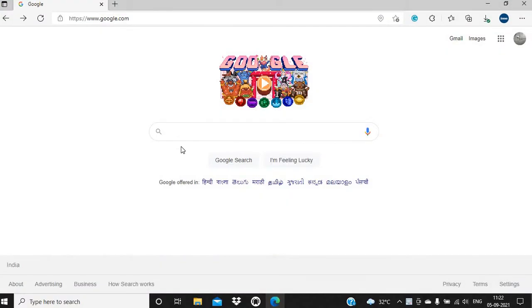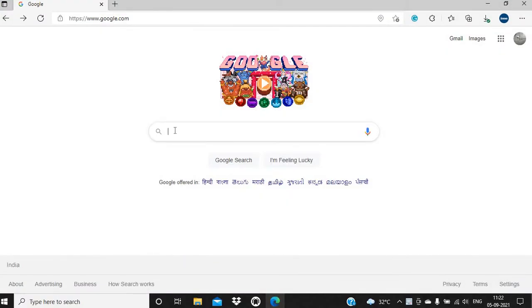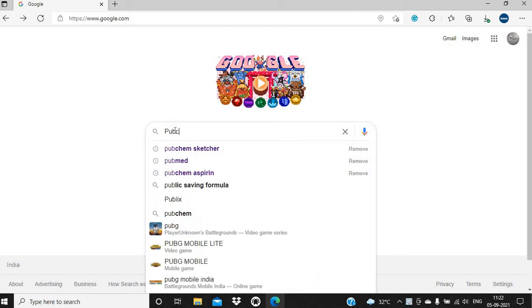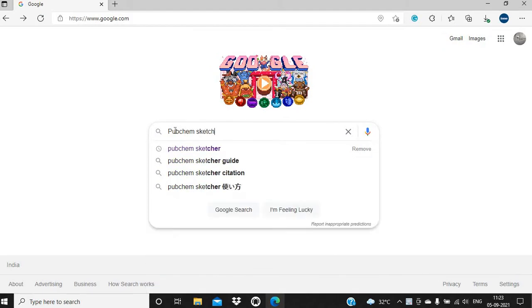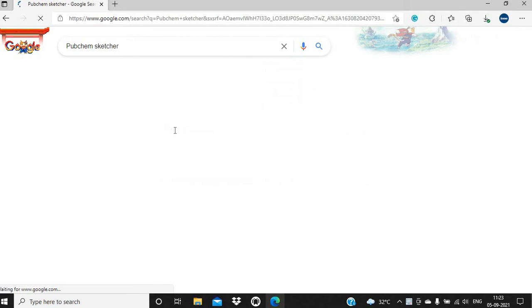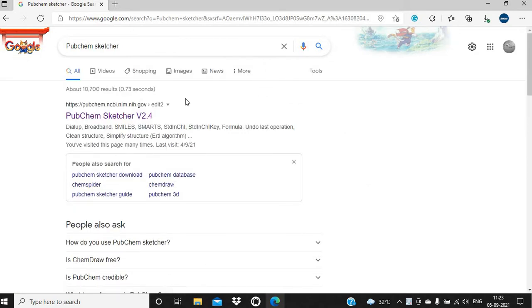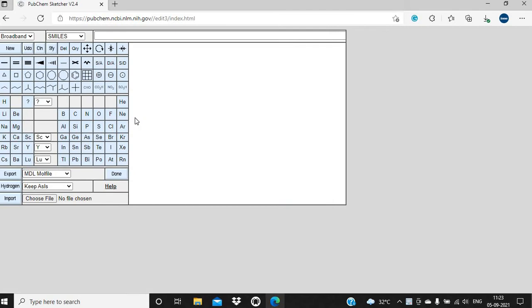For PubChemSketcher, we have to simply type PubChemSketcher in the Google search bar, and then this will give you the top result: PubChemSketcher version 2.4. So you have to simply click on this, and this is the interface of PubChemSketcher version 2.4.